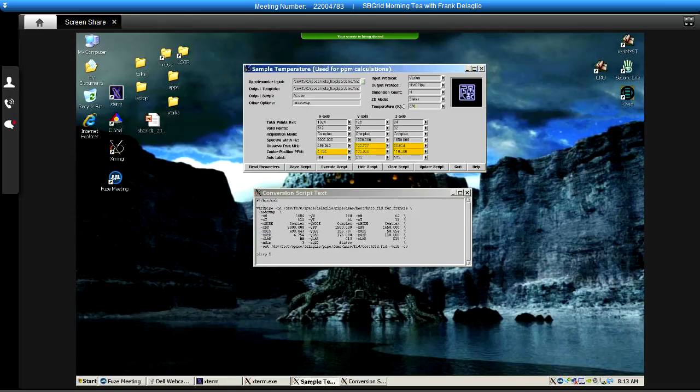So I'm going to type in the correct temperature here by hand, 278, and I'll return to the graphical interface. Right now, the center position of the x-axis of the data, the directly detected dimension, is set to a particular chemical shift value, and instead I'm going to set it simply to the keyword H2O, which means interpret the center position as if it's at the chemical shift of water.